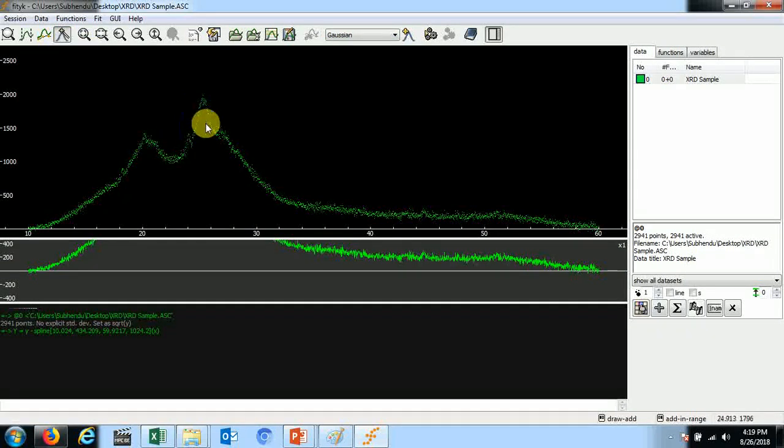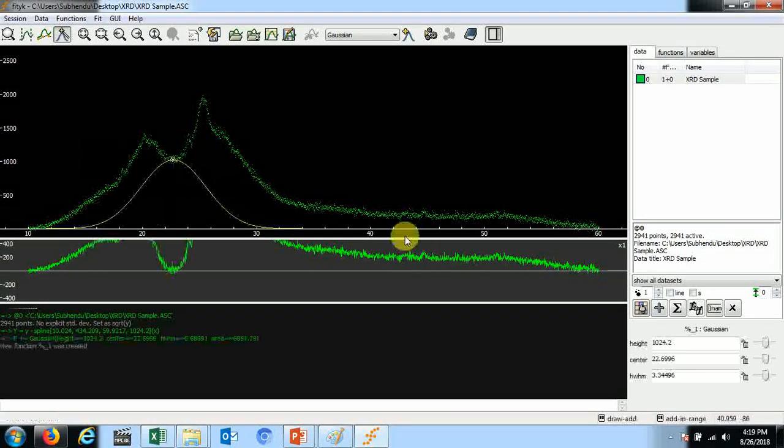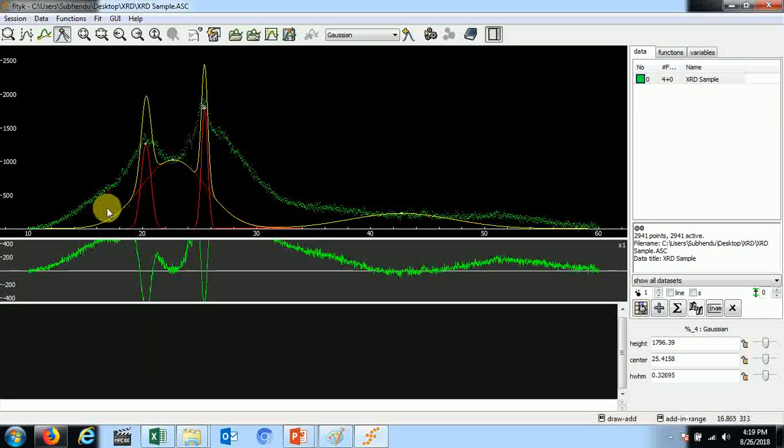Remember, the sharp peaks will be appearing for the crystalline domain and the broad amorphous halo will be appearing here, maybe here, maybe here. To assign the broad amorphous halo, we can consider the crest of this part as the peak position of the broad amorphous halo. Okay. Let me insert the crystalline peak. Here is also another peak. Here might be one more.